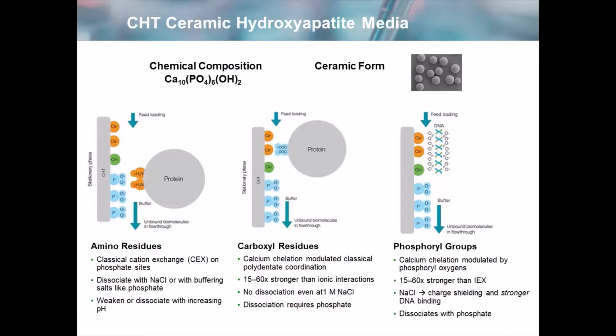Now, I want to switch gear to talk about another type of mixed mode chromatography media. It's hydroxyapatite. It's an inorganic chromatography material. The composition is shown here: calcium, phosphate, and hydroxyls.